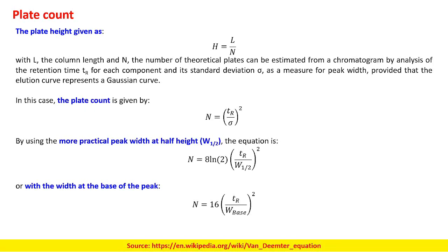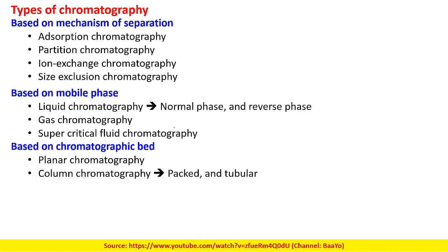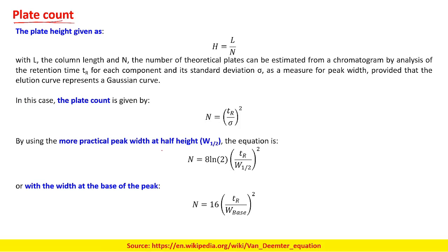So good evening everyone. Today we will start with the plate count. In our last class, we have been discussing the different types of chromatographic techniques, and there we discussed planar chromatography and column chromatography. Now, coming to the plate count.